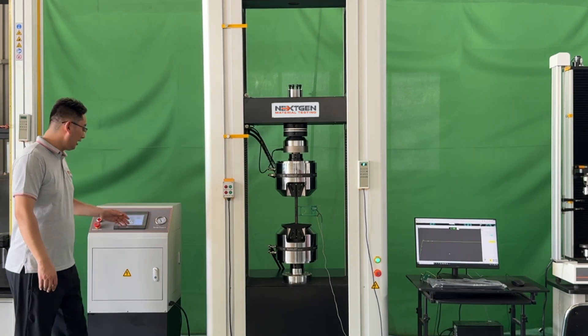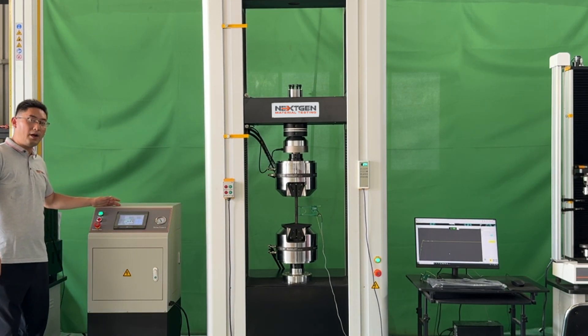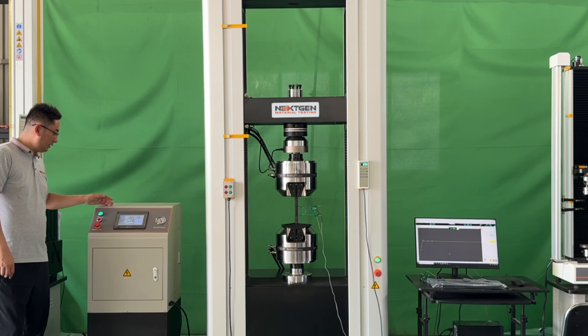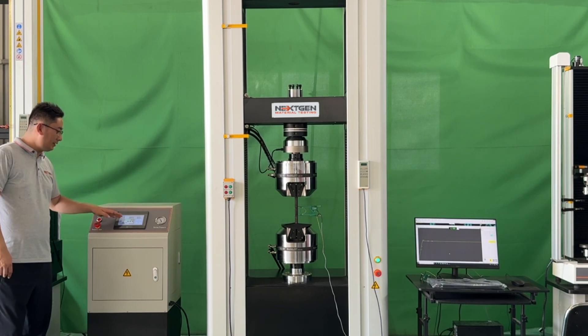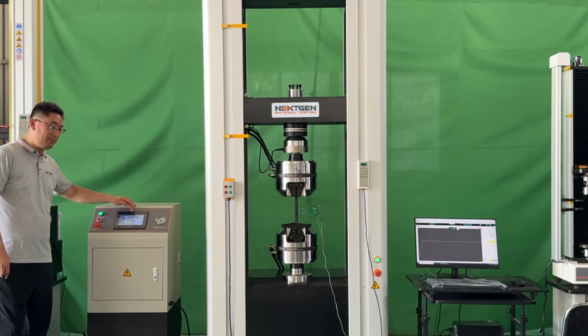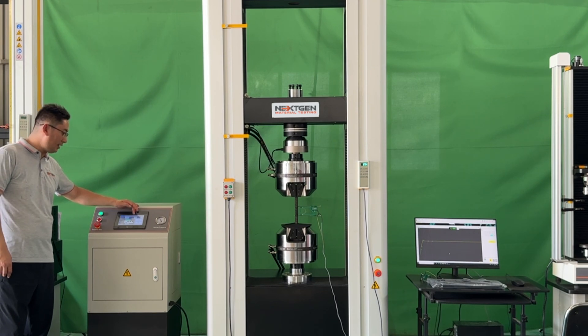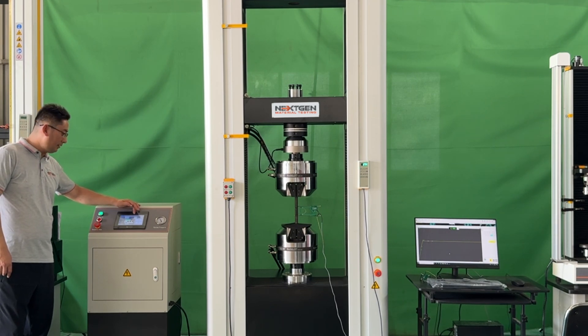This is the hydraulic power pack with touchscreen operation. It presets the testing pressure and controls the upper and lower clamping of the hydraulic grips. The hydraulic operating unit is designed with user friendliness in mind.